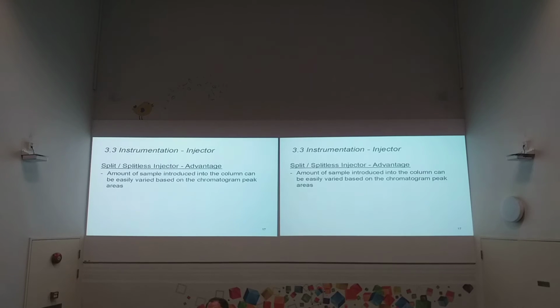That's why, when we go to a scientific lab, safety is important. What happens if the product is toxic? You vaporize it, and 99% comes out, which sounds very scary, but don't worry, all this has been taken into consideration. It is linked to the exhaust, which is why a GC instrument needs a proper venting system. It is all linked to the so-called fume hood, which does the proper treatment before it goes into the environment.